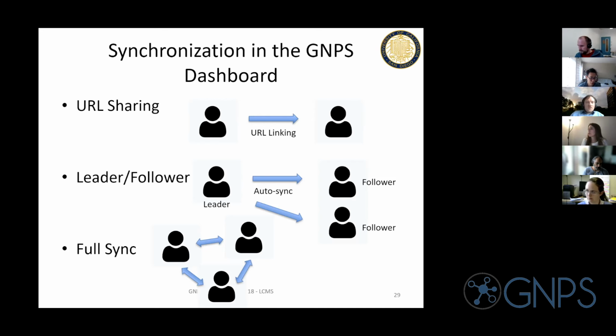But if you made a private MSV data set, they will not be visualizable. We're thinking about adding some of these features for making it easier to review data sets with reviewer credentials, but those are still in the works. So hopefully that answers the question.